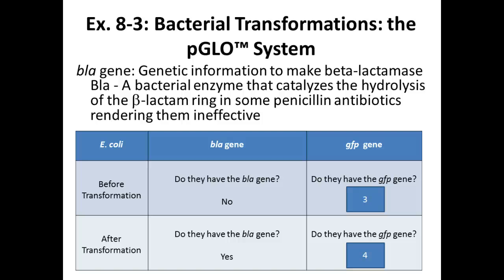Green fluorescent protein, the GFP gene, do they have this before transformation? No. We're going to give it to them, right? So they don't have it, we're going to give it to them.